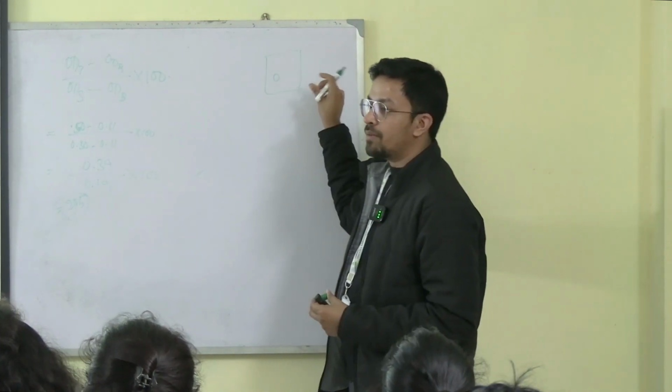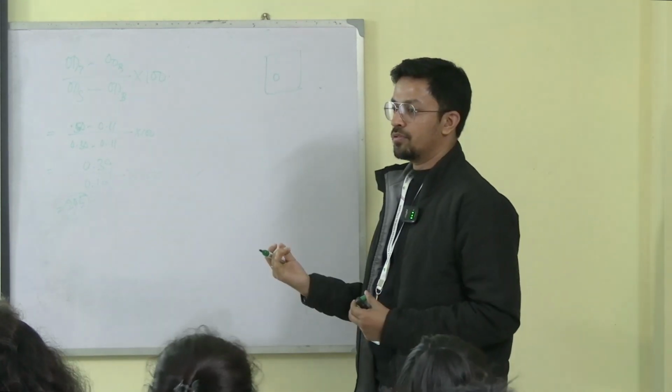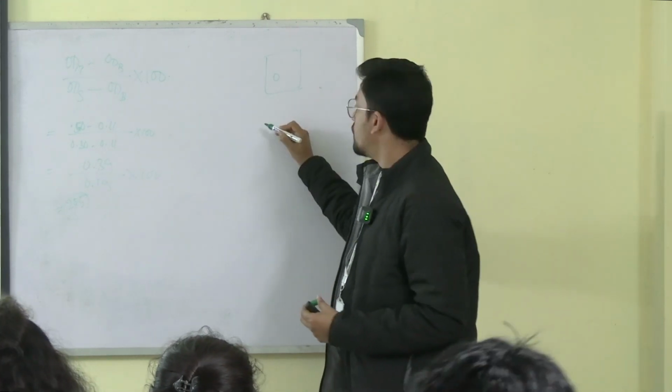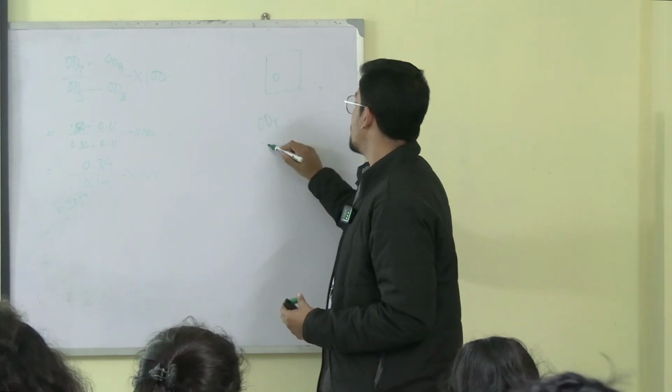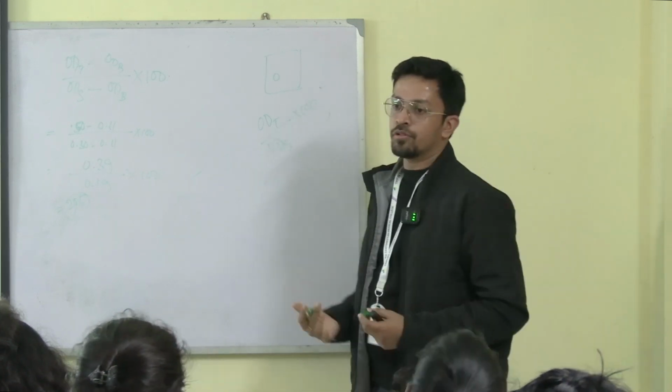Because if you are making the ODB 0, then the standard and the test values are already getting lower. And because of that, if you are making the ODB 0, you can then measure as ODT by ODS into 100. Whichever process you want to do, you can do.